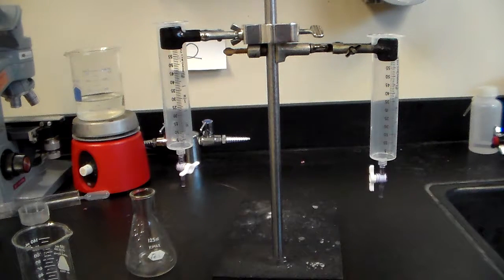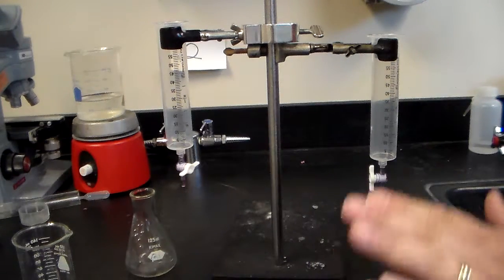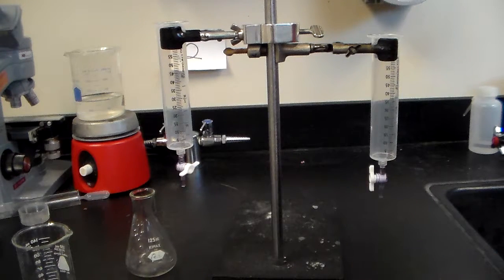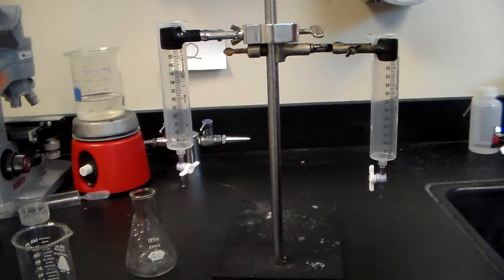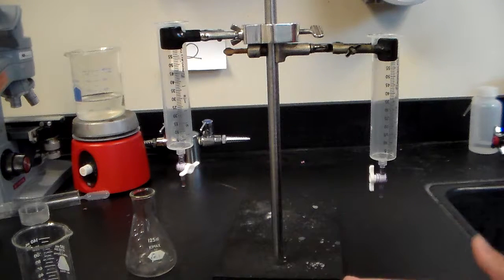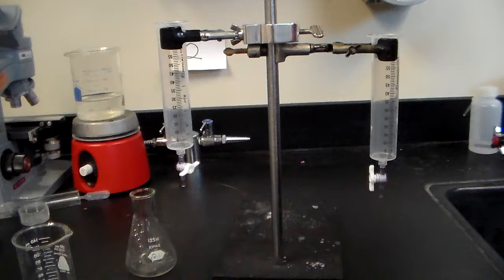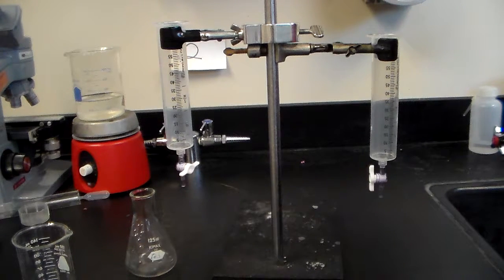To do the titration, we're looking at measuring a known solution, known concentration of an acid, and comparing it to the unknown concentration of base. We're working with a strong acid and a strong base here. We're looking at nitric acid and sodium hydroxide. Nitric acid is a strong acid, sodium hydroxide is a strong base.